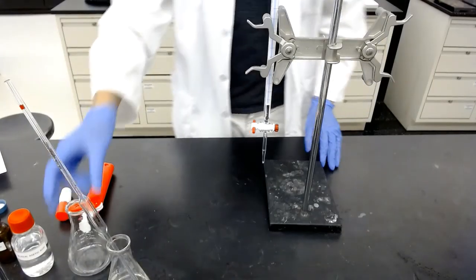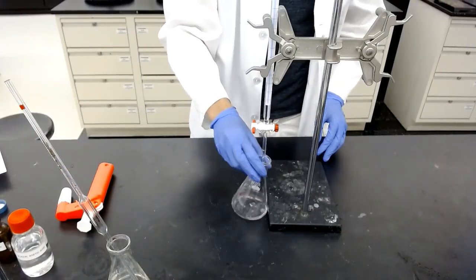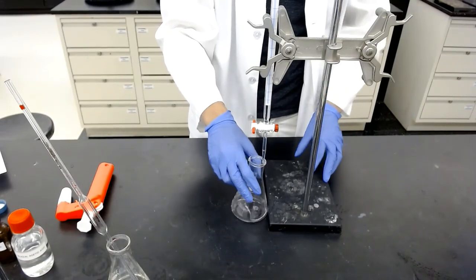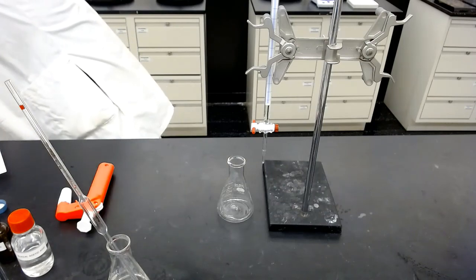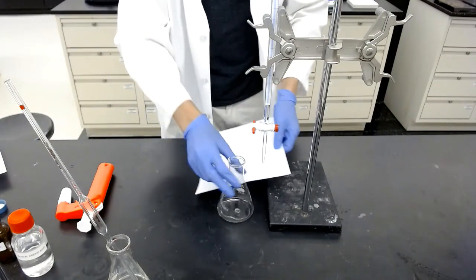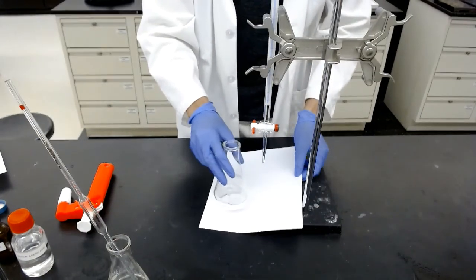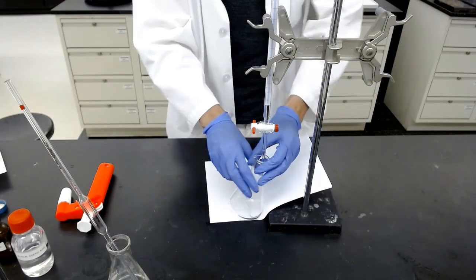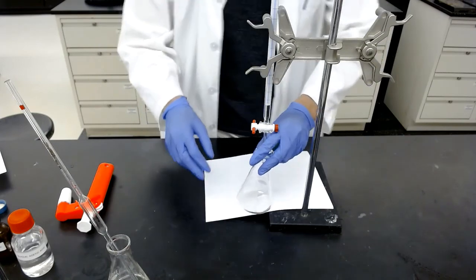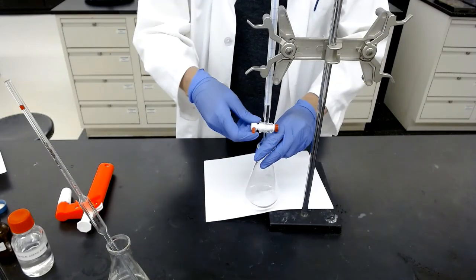Now I'm going to bring this acid solution here and start the titration. I'll bring some white paper as a contrast so you can see the color change much better. So here we go.